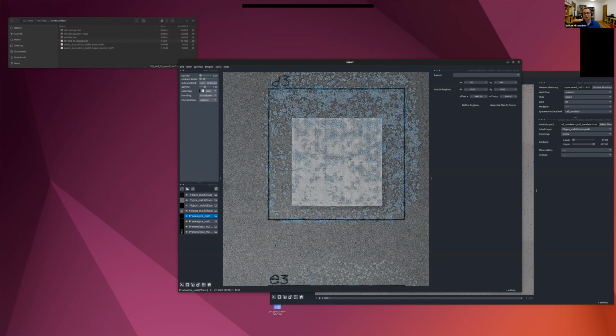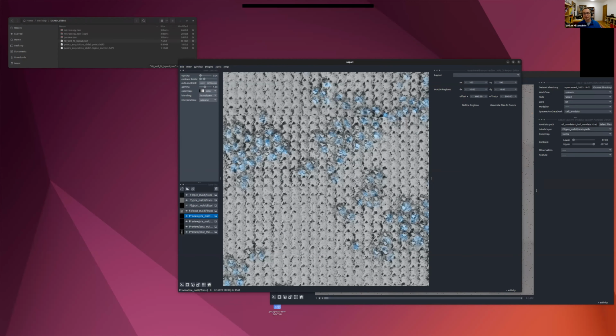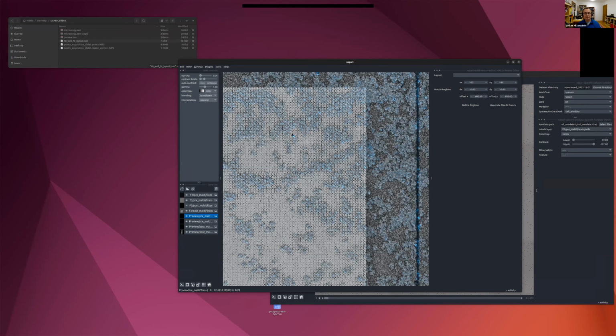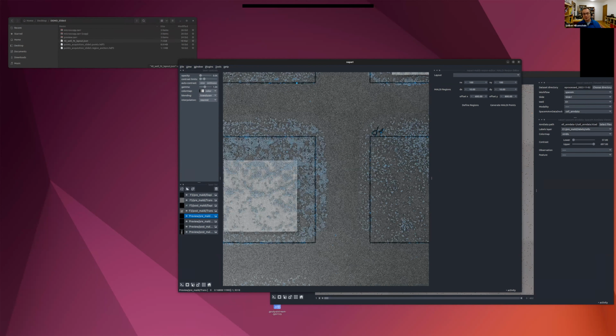You can see the fluorescence channels. You can zoom in. This is not even a full resolution preview. Here you see some stitching errors. That's just because we just place it there. I mentioned I only show this for one well here.